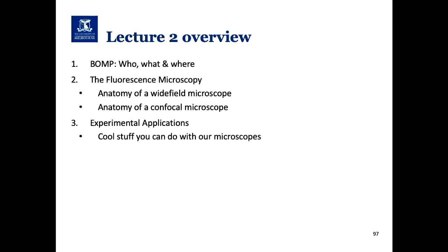Okay, so with that we're done for today's lecture. So we've covered what the platform is, we've covered the anatomy of a wide field or epifluorescence and a confocal microscope, so hopefully now you've got a better understanding of those two different systems. And then you've learned about some of the cool stuff that we can do within the platform. Hopefully some of it applies to your research. If you want to know more about a specific technique, then please let us know.